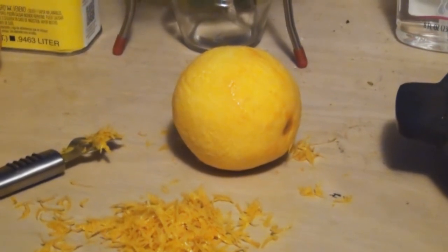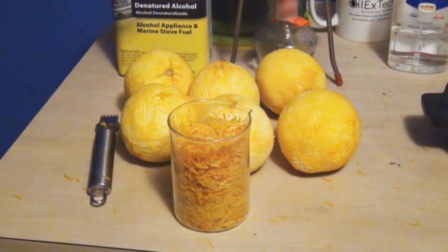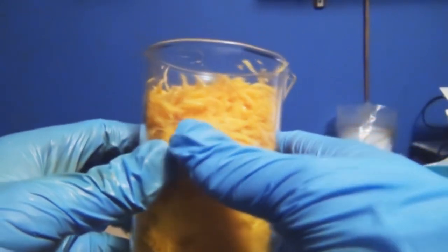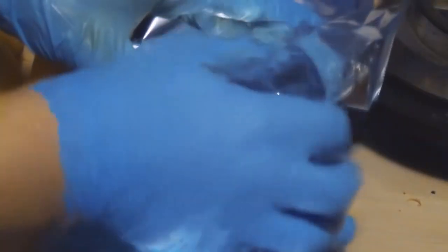The inner pith does not contain as much limonene as the peel itself. After you've zested all your oranges, we're going to transfer all the zest into a beaker. Once all of the orange zest is transferred, we're going to wrap it with tin foil to keep the zest from drying out.